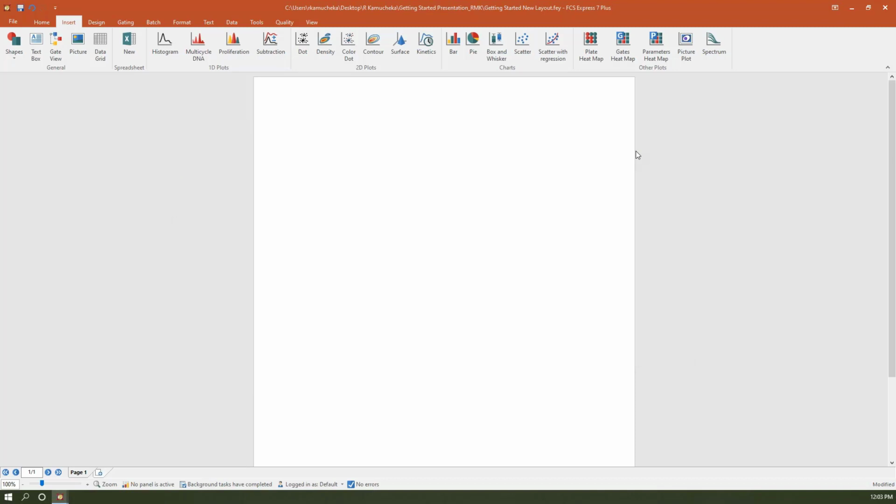Now we're looking at this first workspace. We've got it open here. And it looks a lot like PowerPoint, Microsoft PowerPoint that is, and that is definitely by design. We know as anyone that has gone to classes that you have likely done something in PowerPoint. We wanted to give you an element of familiarity, even if you've never used our software before. And this is exactly what we've done here. So what we've done, we've organized the tabs and the tools very similar to what you would actually see in PowerPoint as well.